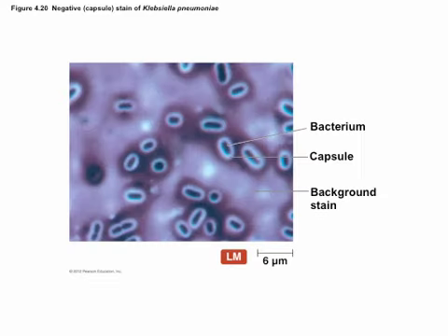So this is what's called a negative stain. Usually, a positive stain means that you are staining the feature that you want to look at. So Gram stains are a positive stain. You're staining the cells, you want to look at the cells. Capsule stains are typically negative stains. That means that you're staining everything except the feature that you want to look at. And you can see this is the cell stains. This is the background stains.